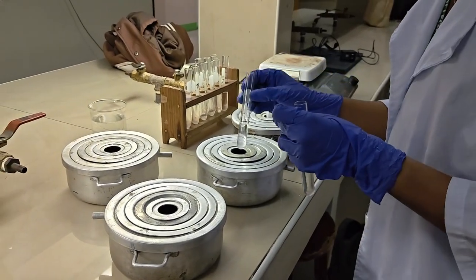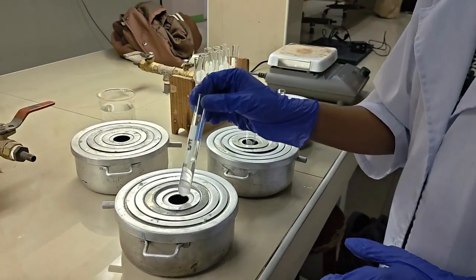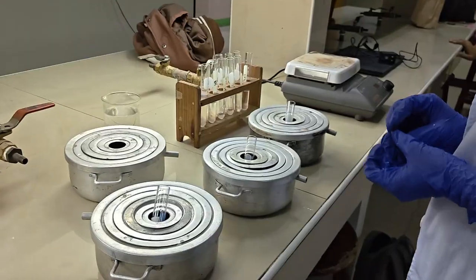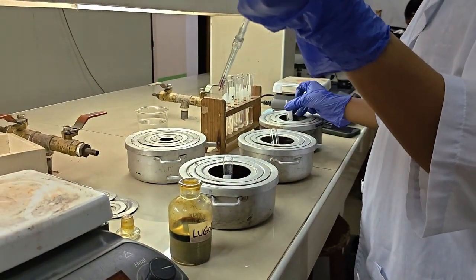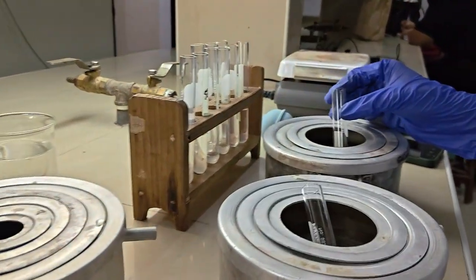For the second experiment, which is the effect of pH, we investigated how pH affects salivary amylase activity. 3 test tubes were labeled Tube A for pH 4, Tube B for pH 7, and Tube C for pH 9.